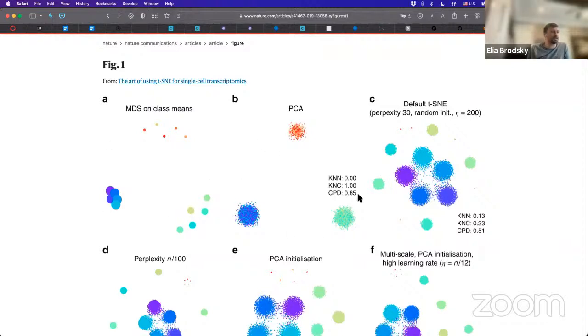And here we can see that the differences are going to be dramatic. So typically when you do a dimensionality reduction approach, you then want to assign groups, and that is done through clustering, right? Somebody was asking, well, how is clustering performed? Well, typically, let's take PCA now. Let's take a look at this example, because here we really see some outliers primarily, right? And not very good clustering.